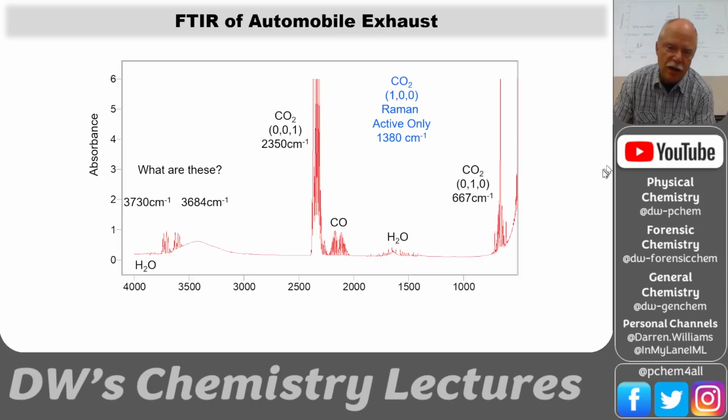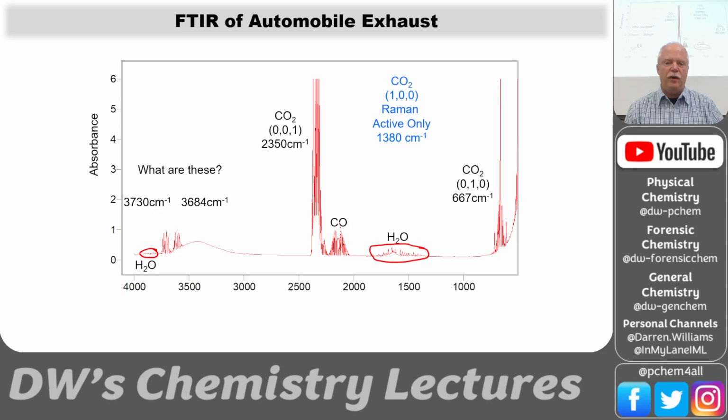Here's automobile exhaust, and we see a bunch of different peaks. We see some water; these are the vibrational and rotational lines of water. We have carbon monoxide because we have some incomplete combustion. When you do your carbon monoxide lab, I've zoomed in on this and clipped that out, and that's your data that you have on Blackboard. You will analyze all of those little peaks.